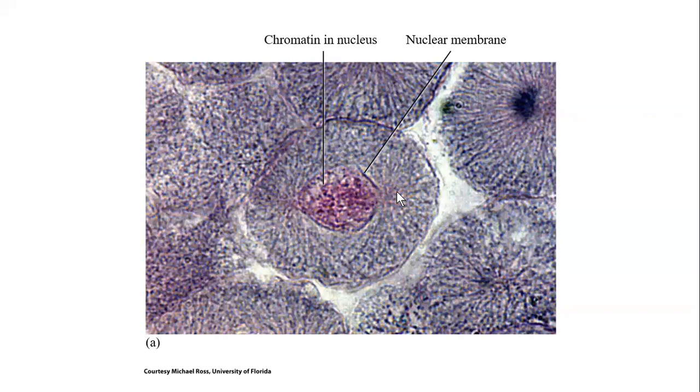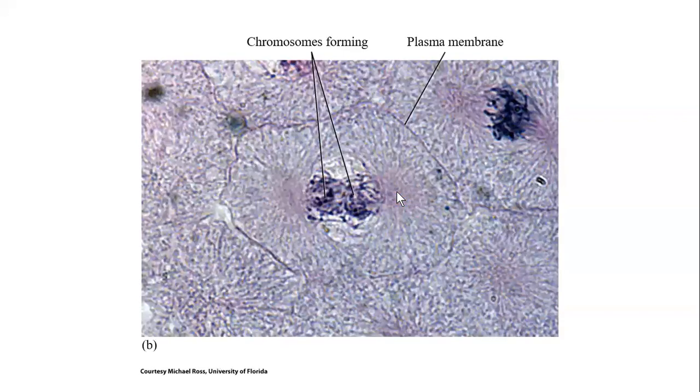So in the cell cycle, once the cell division mitosis actually begins, we see prophase. Up here, you also see another prophase. Take a look at the nuclear membrane disappeared. What we have here is the chromosomes becoming like stick-like structures. You can see it in both cases. And so this is the prophase. Mitosis, the division of the nucleus, has begun.